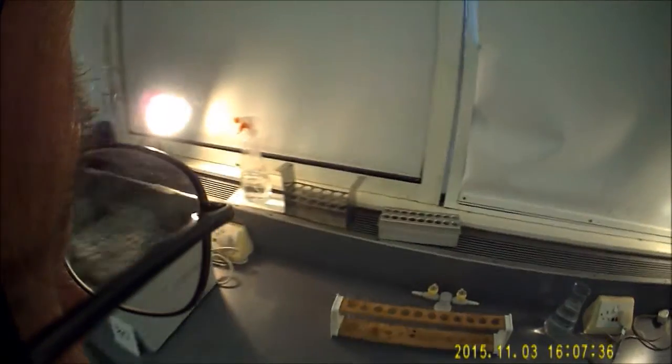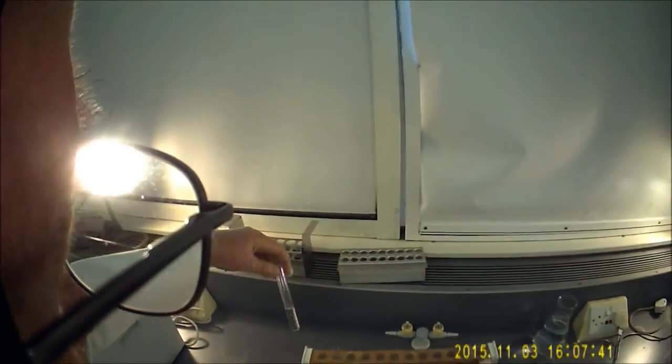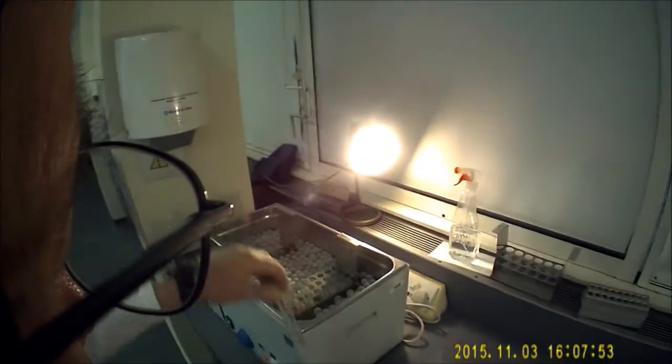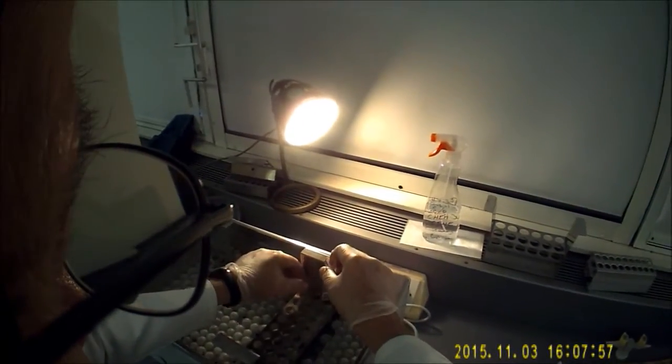Measure out your sodium thiosulfate — 10 cubic centimetres. Measure out your hydrochloric acid. Just write your initials on the top there and pop them into the water bath, just like so.